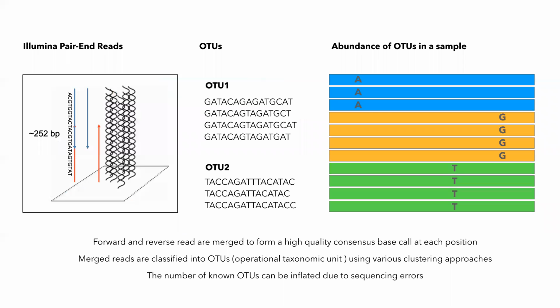Yes, if you have two examples of the same thing, and you can see a change in just one of the copies, then you know it might be a mistake. But if you have a change in two copies, that gives you higher confidence that you are finding a real change, right? I'm talking about in the context of aligning those reads to the reference genome.